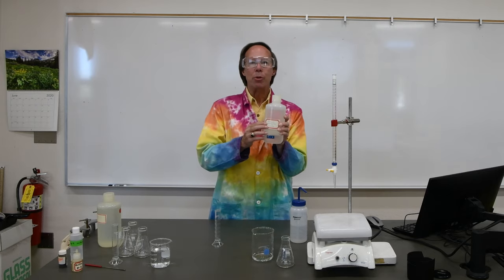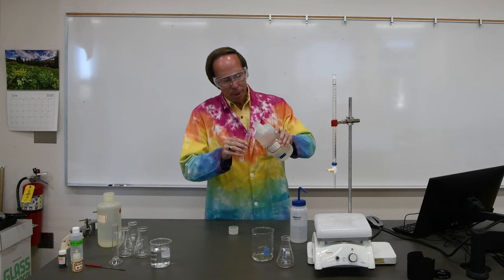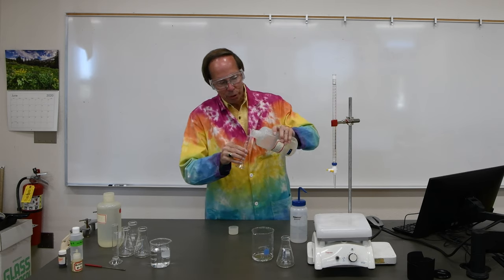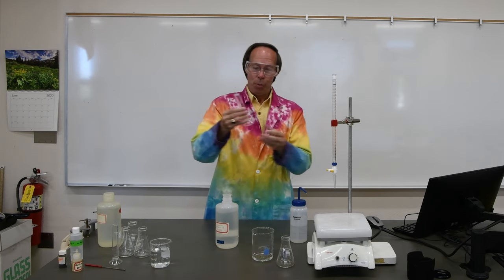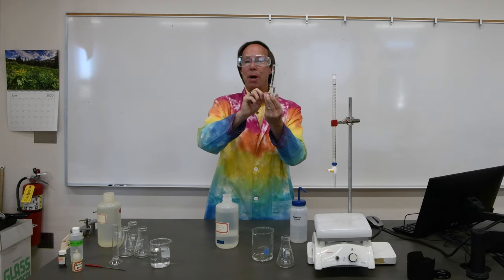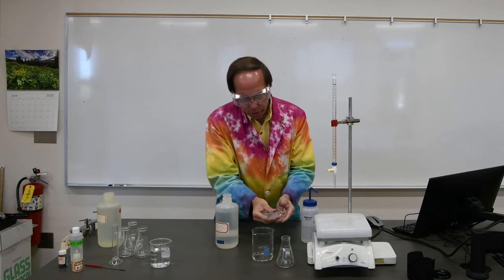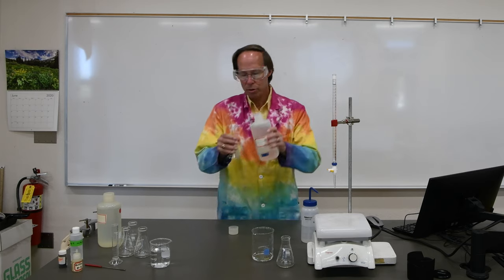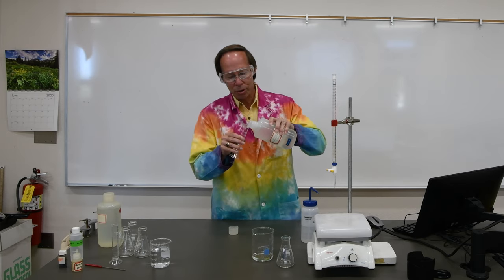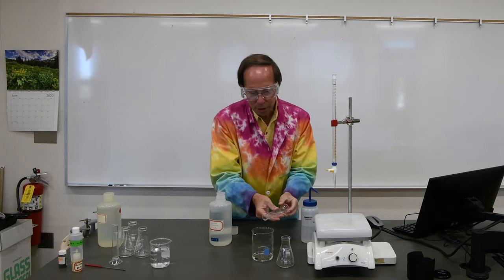Now I'm ready to measure out my sample of test hard water. As soon as I add my very carefully prepared calcium to the cylinder, what just happened? Well, what happened is the water that was left in the bottom of the cylinder has diluted the calcium, and that's not good. So let's discard this first sample. In fact, like we did with the burette, let's go ahead and rinse our graduated cylinder out a couple of times just to be sure there's nothing in here but our calcium sample.